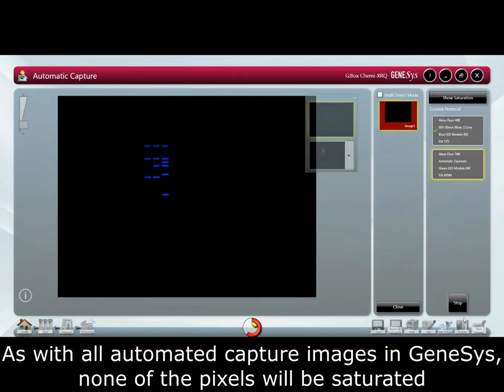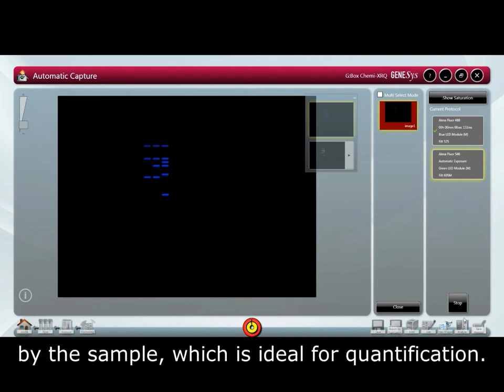As with all automated capture images in Genesis, none of the pixels will be saturated by the sample, which is ideal for quantification.